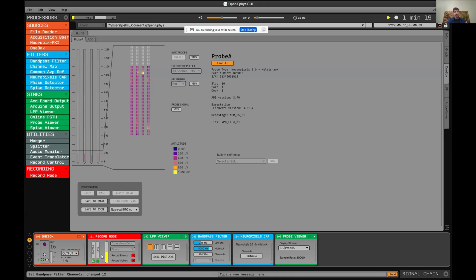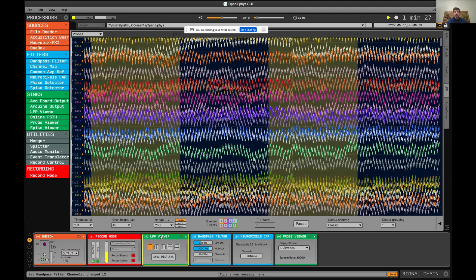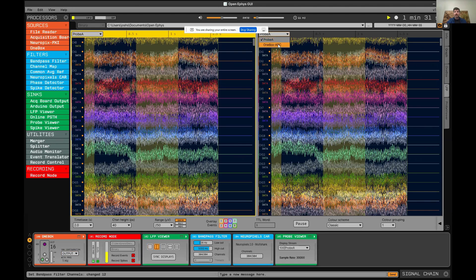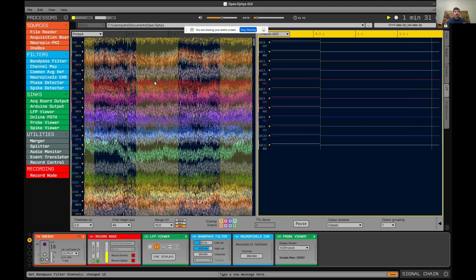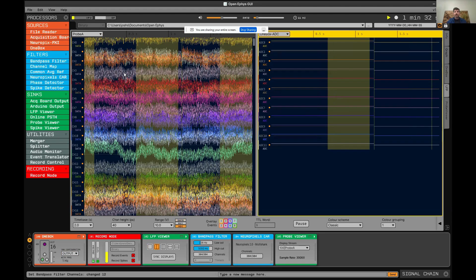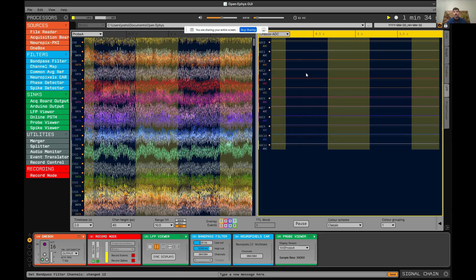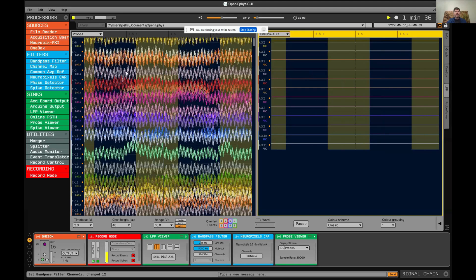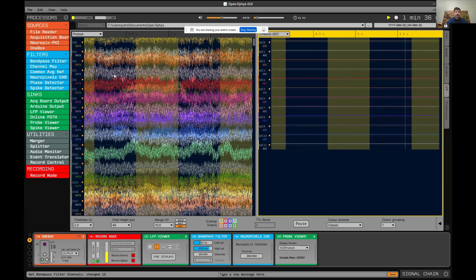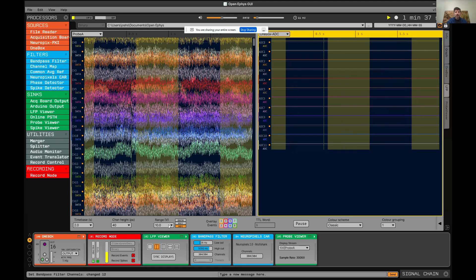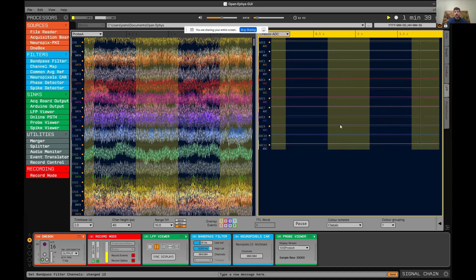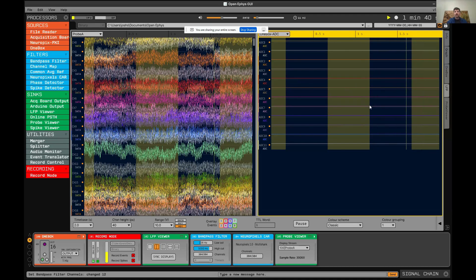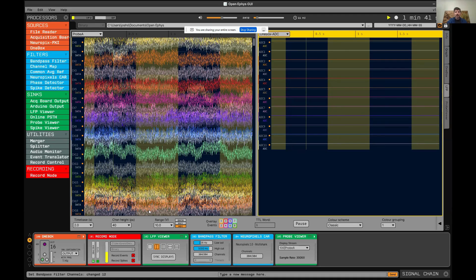This will turn green indicating that these streams are synchronized in real time and all the timestamps that are written by the record node will be pre-synchronized. We can take a look at the LFP viewer, split this vertically. Now you can see the probe data and the ADC data side by side. You can see this one hertz signal overlaid in yellow.